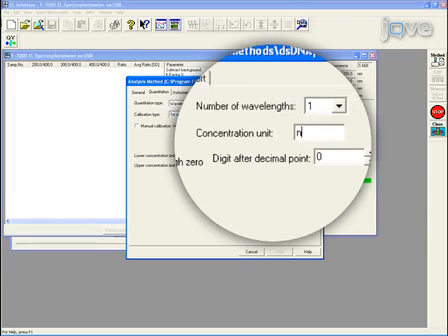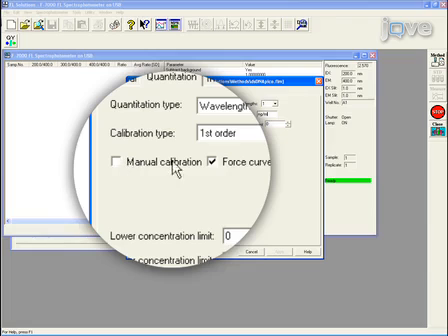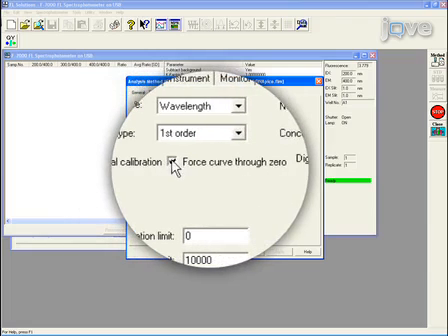Enter nanograms per milliliter for the concentration unit. Ensure that manual calibration and force curve through zero boxes are not checked.